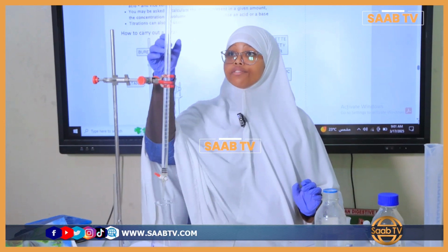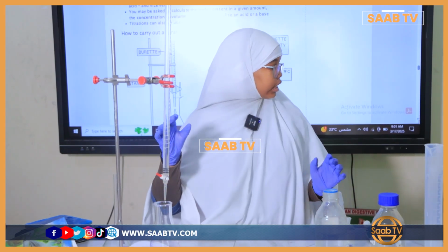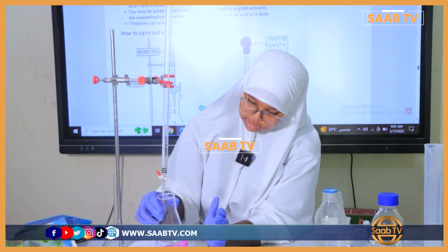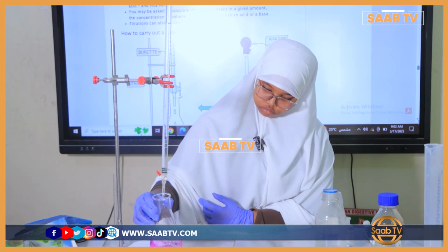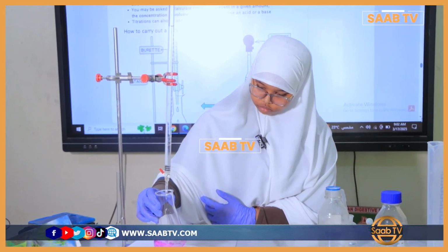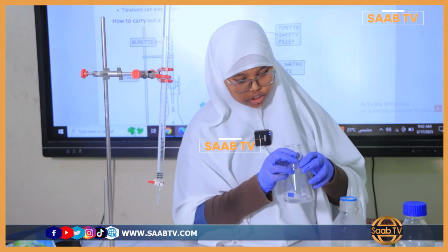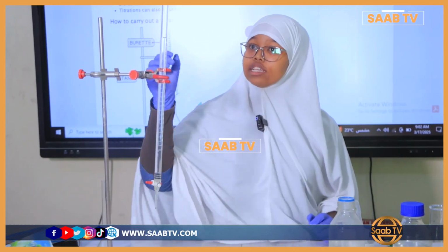So here we have the acid that we need to neutralize the alkali with. We get the initial volume of the acid, which is 13.1. We do it drop by drop to get the exact amount needed to neutralize it, and we stir vigorously. And right now we have a neutralized solution of sodium hydroxide and hydrochloric acid.